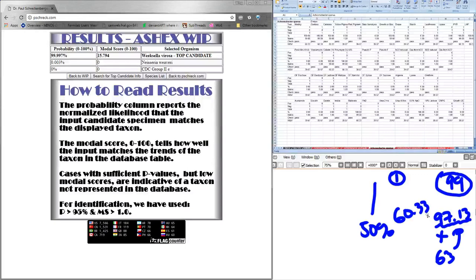And this happened quite a bit, right? This is where I've repeatedly stressed that these are tools. The ASHEX matrix really shouldn't be used as a definitive ID. You should use it as a means to support a definitive identification. For example, when I went back and got the stack of sheets that my dad had left, that he actually looked at and were just waiting for me after he passed away, I found a case where the raw probability calculation actually didn't get it right.